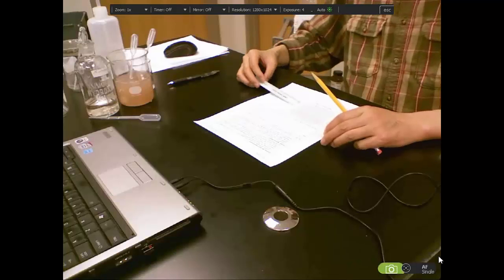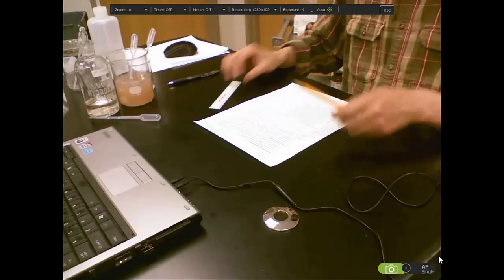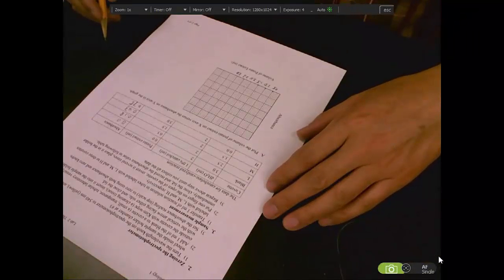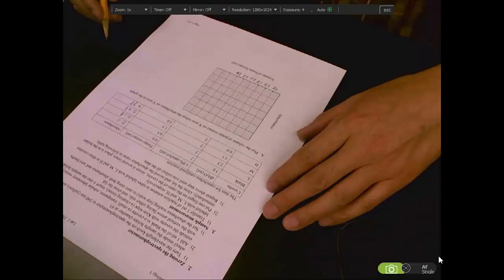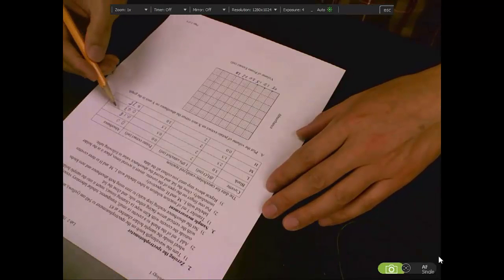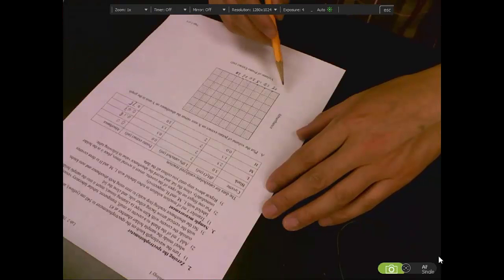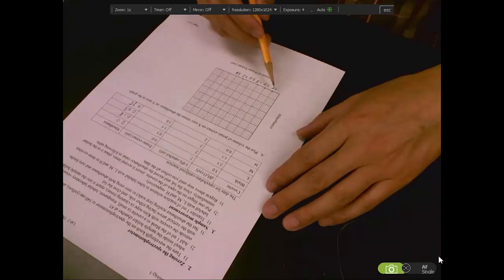Now I can work on the graph, how to draw a straight line reflecting the relationship between the volume of potato extract and the absorbance. As we know, the maximum absorbance is 0.75. So I will find the y-axis and mark the y-axis.